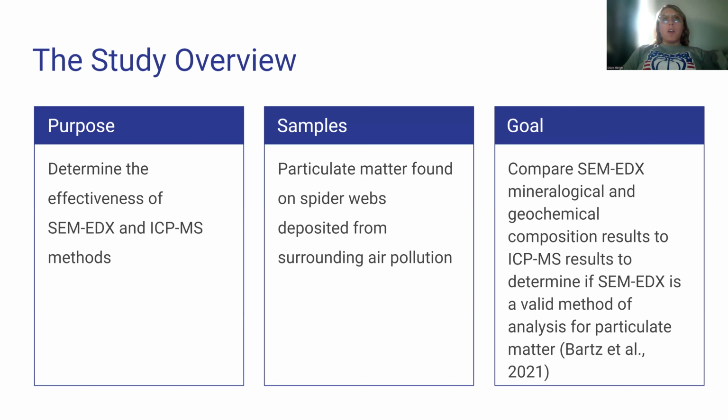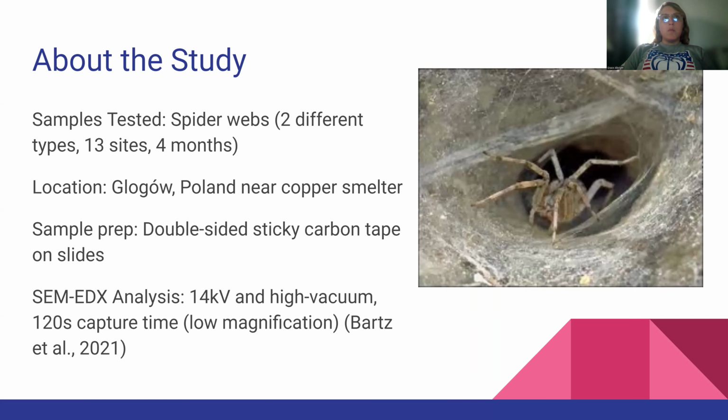Beginning to review our study that was chosen, the purpose of the study was to determine the effectiveness of SEM EDX and ICP-MS methods. The samples that were analyzed were particulate matter that was found on spider webs and deposited from surrounding air pollution. The goal of the study was to compare SEM EDX mineralogical and geochemical composition results to the ICP-MS results in order to determine if SEM EDX is a valid or equal method of analysis for particulate matter, according to Bartz. Bartz is the one that wrote the study that we are about to review.